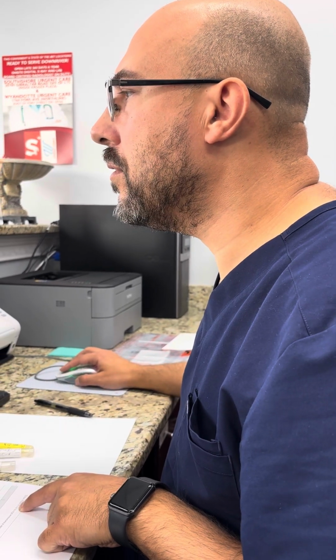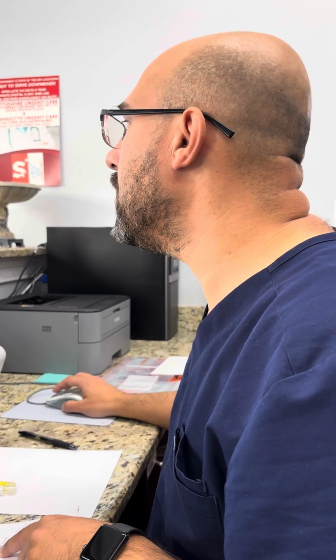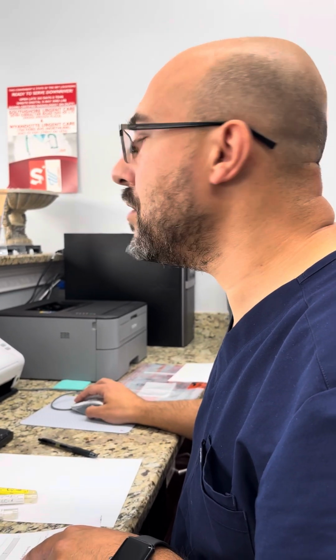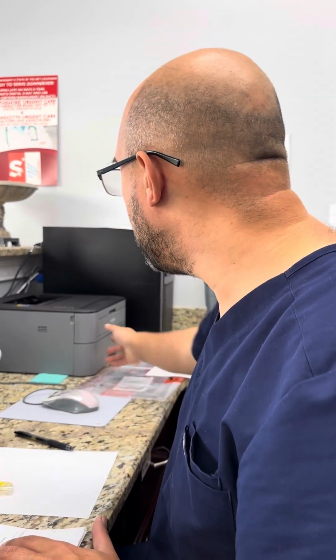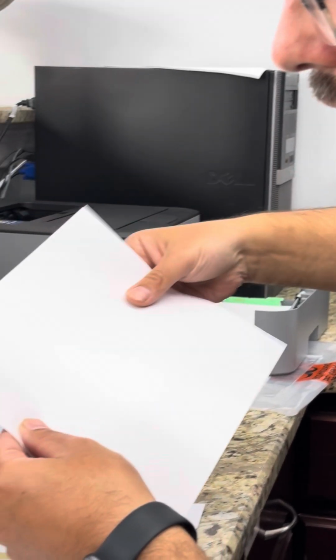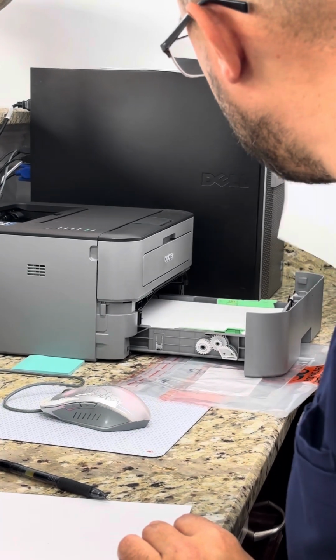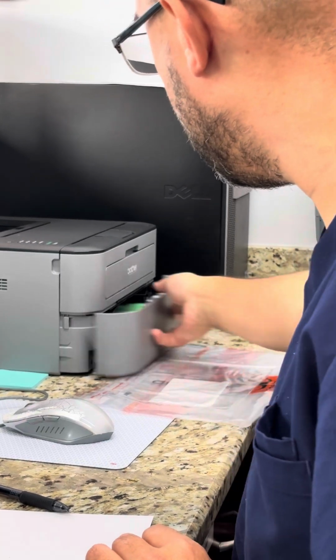All right, beautiful. So everything is in: name, ICD codes, the test has been selected. Go ahead and press save, and the system is going to ask you to go ahead and print the label. Make sure I do need the date of birth and that you put in the label in the right way. Honestly, I hope this is the right way. I think it is. I think it's this way.